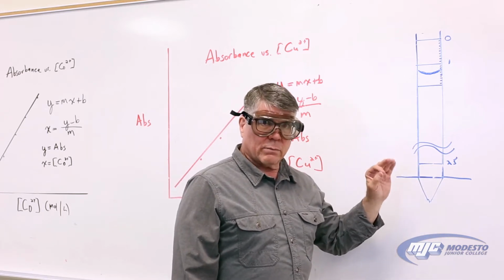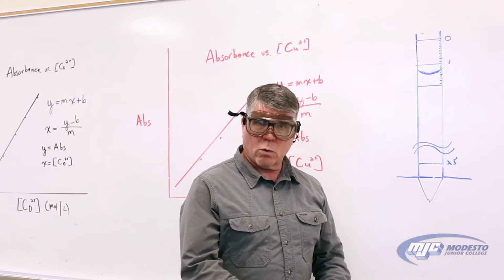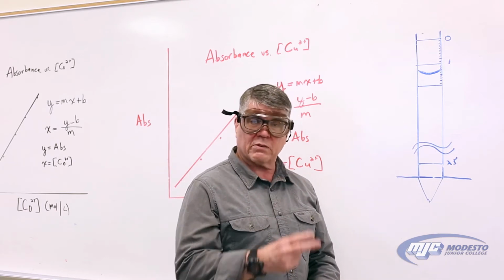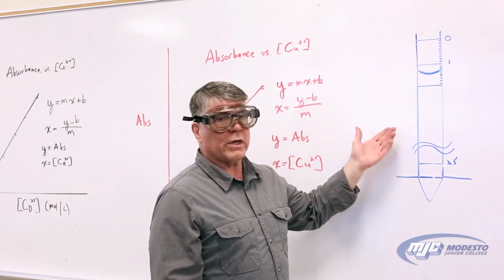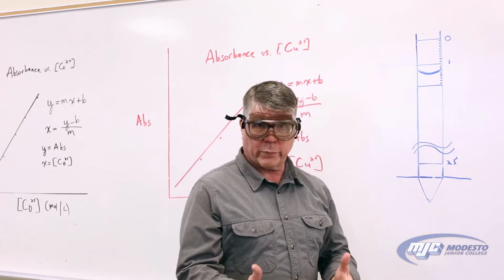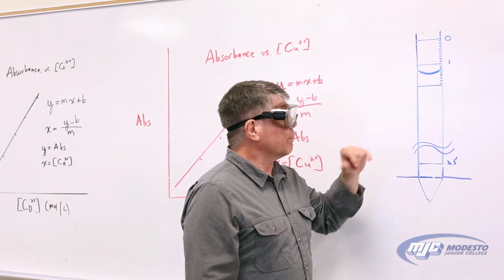The next thing to know about the burette is that the closest marks are 1/10 of a milliliter apart, which means that when we read this burette, we record every measurement from it to 2 places past the decimal, the nearest 100th of a milliliter. And so we read it just like we do any other column with a liquid in it. We read the bottom of the meniscus.